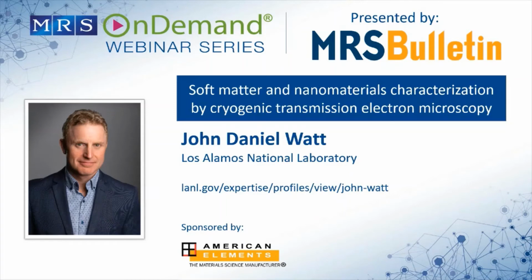And we're now going to open up for some questions that have been coming in from the audience in the webinar. So the first question is, which organic solvents are suitable for cryo-EM? And could you also elaborate on any modifications that are necessary to the Vitrobot robot that you described in order to make it compatible with organic solvents?